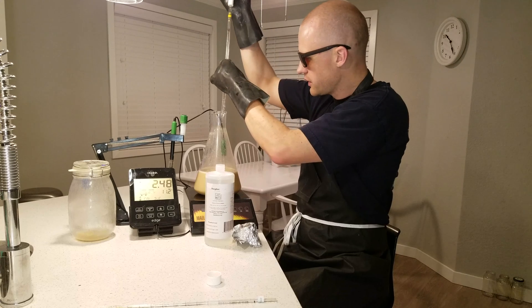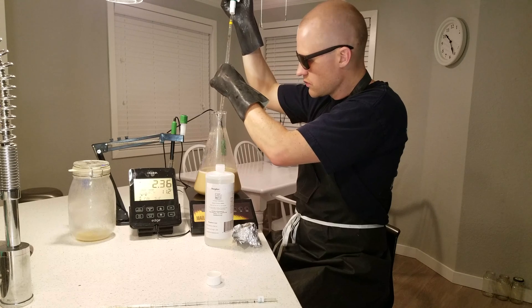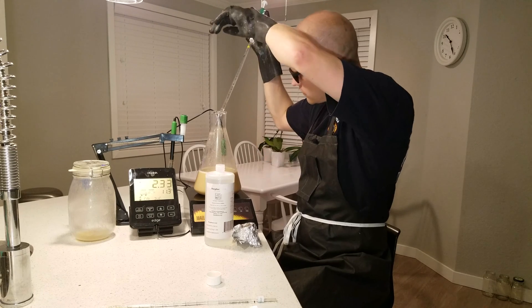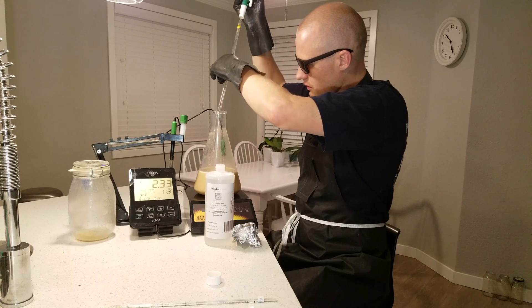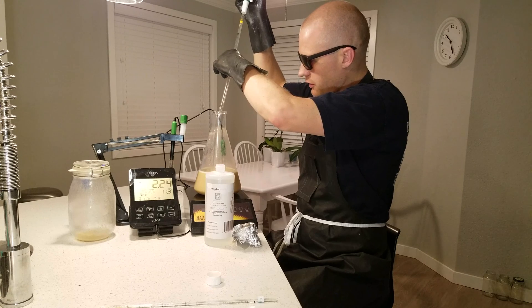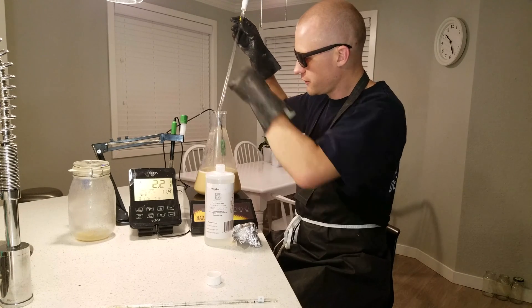We're adding at 4.5 milliliters now. We're getting into the range where it would be acceptable to start the timer, but we're going to try to go exactly for 2.1.